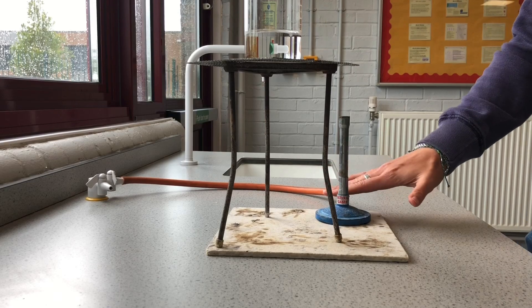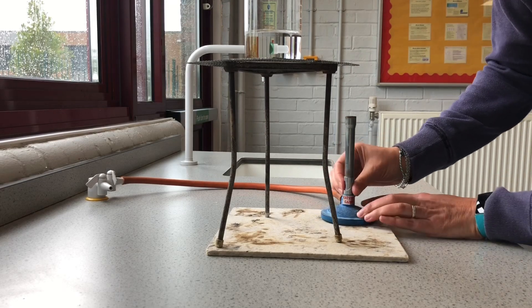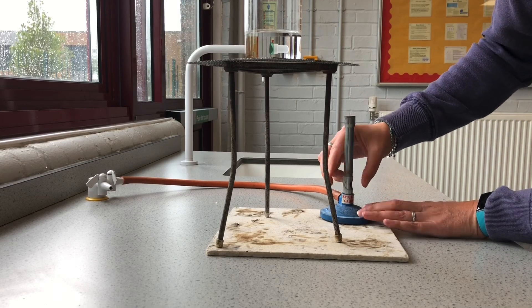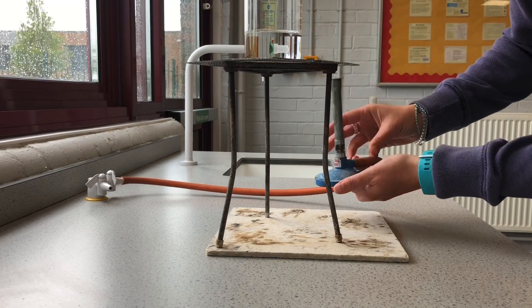Now I'm going to show you how we light the Bunsen safely. If we look at the Bunsen, we've got this part called the chimney, and this part called the collar. You can see the collar turns, and we've got the air hole — here it is open.